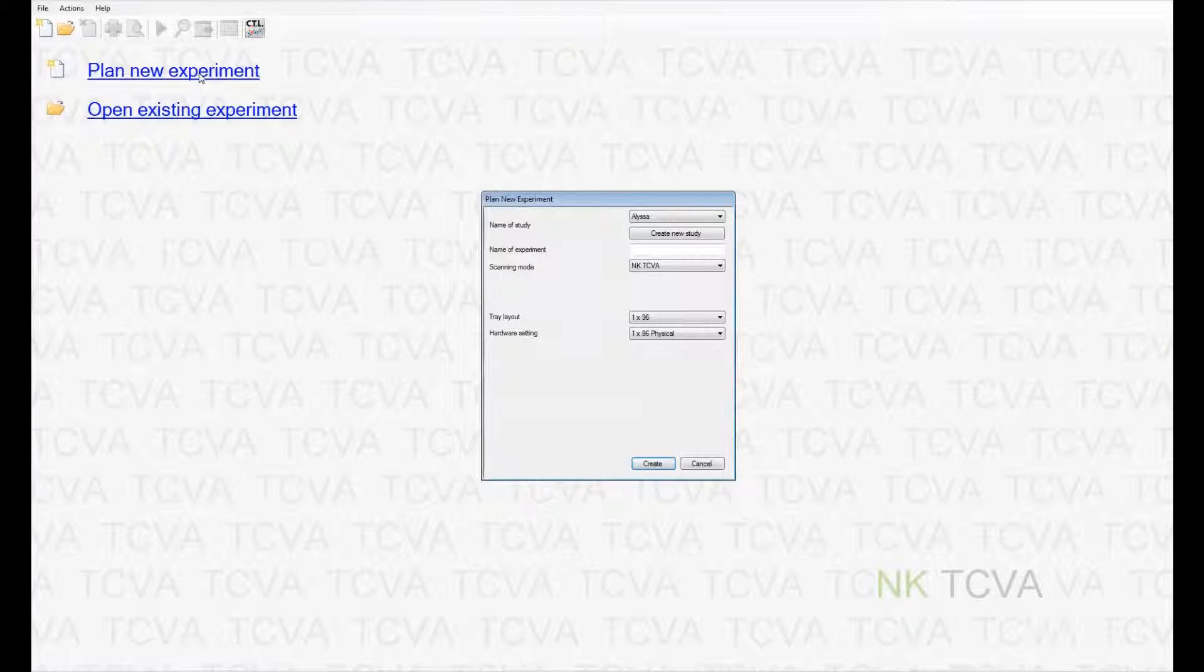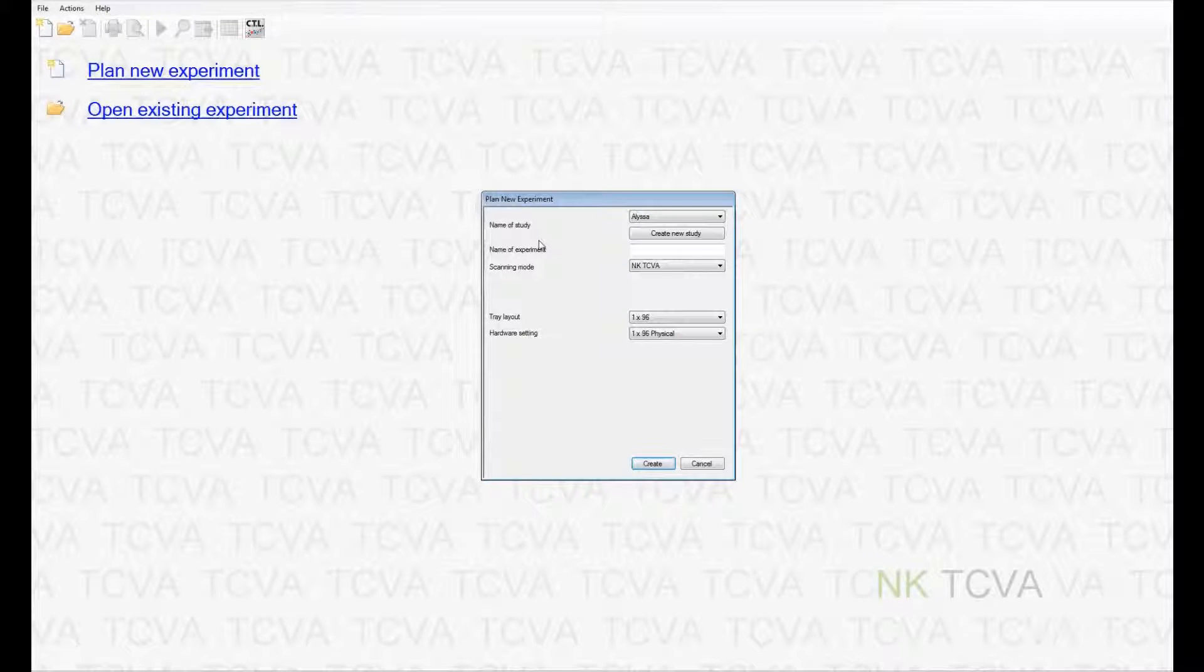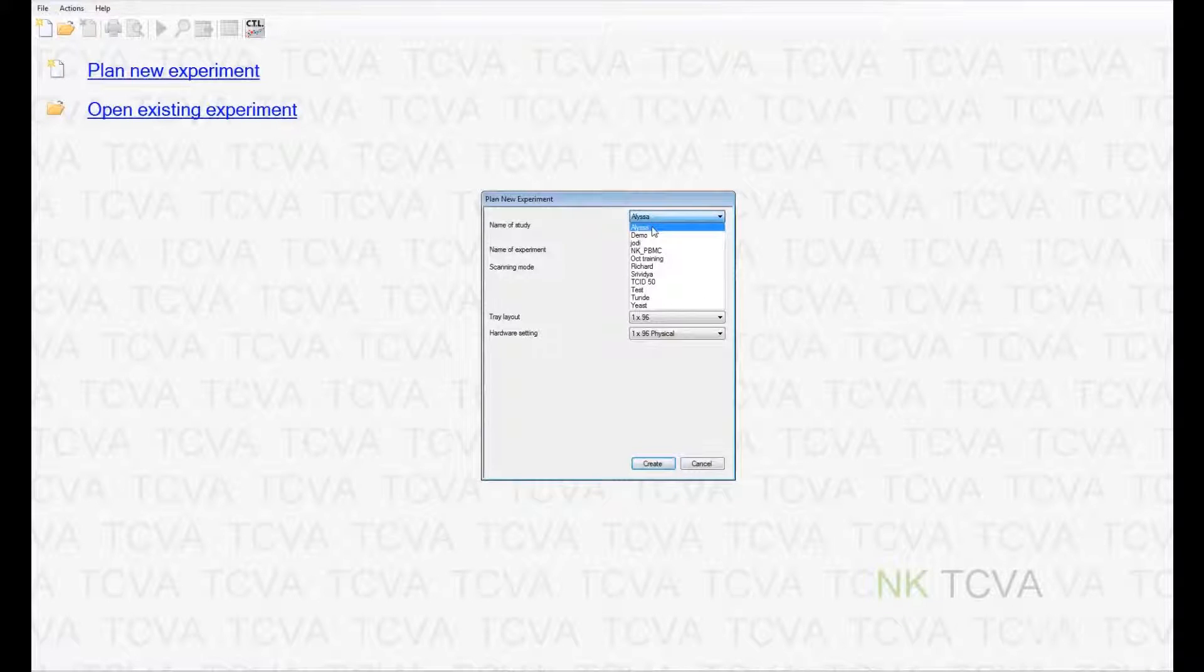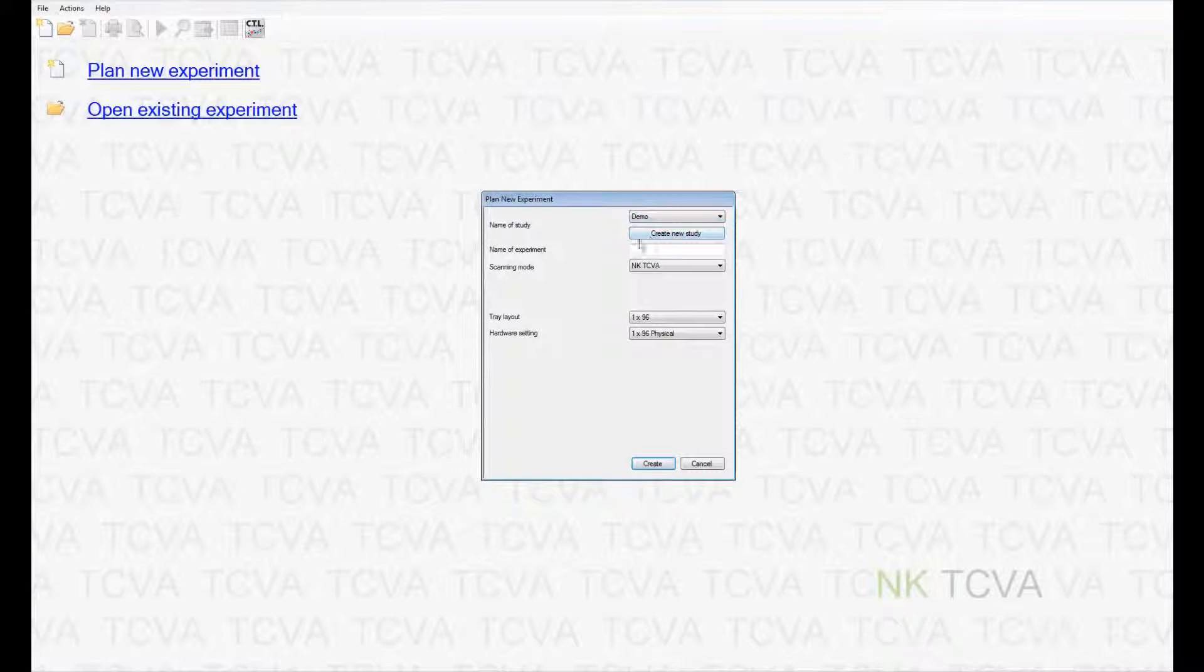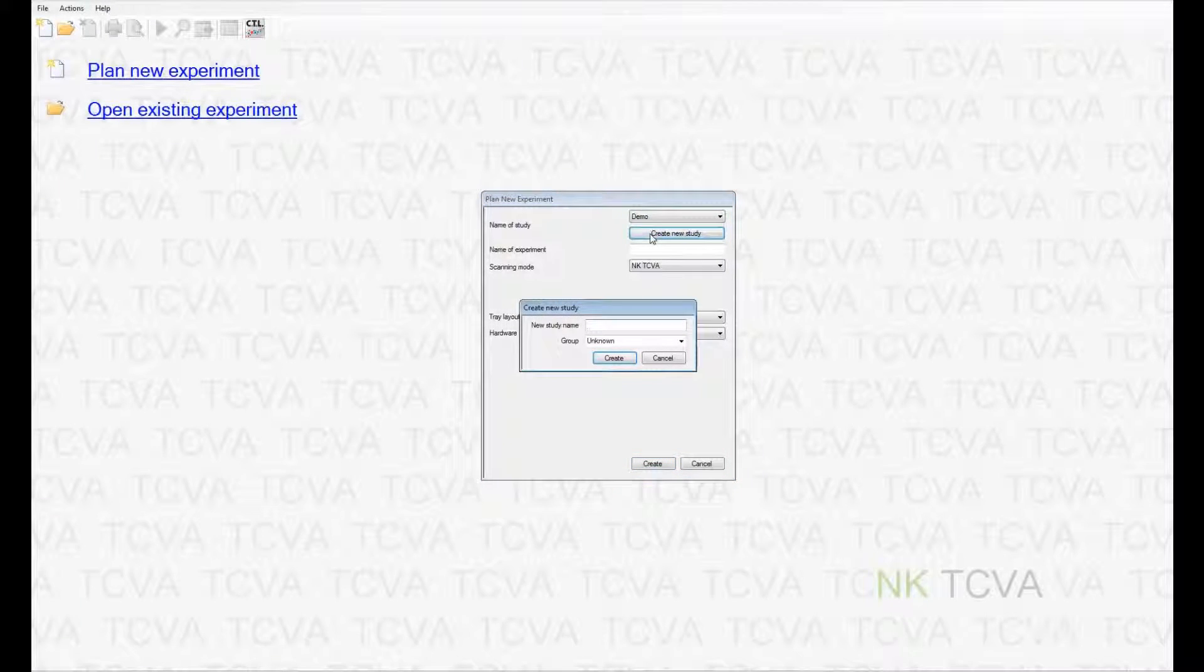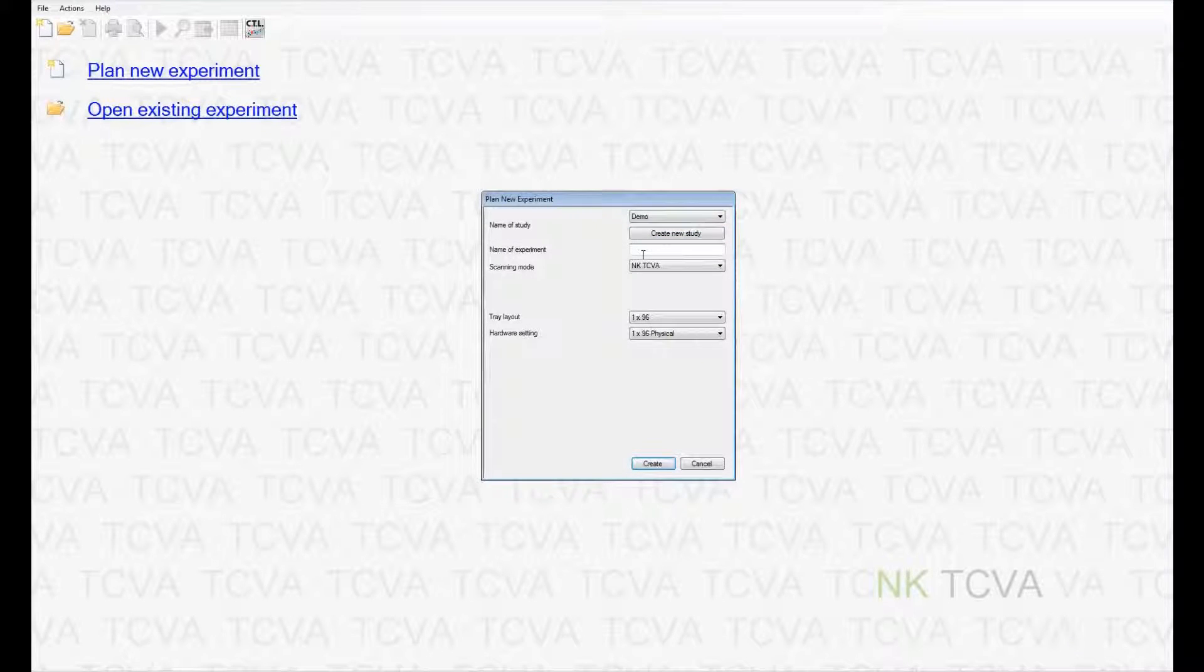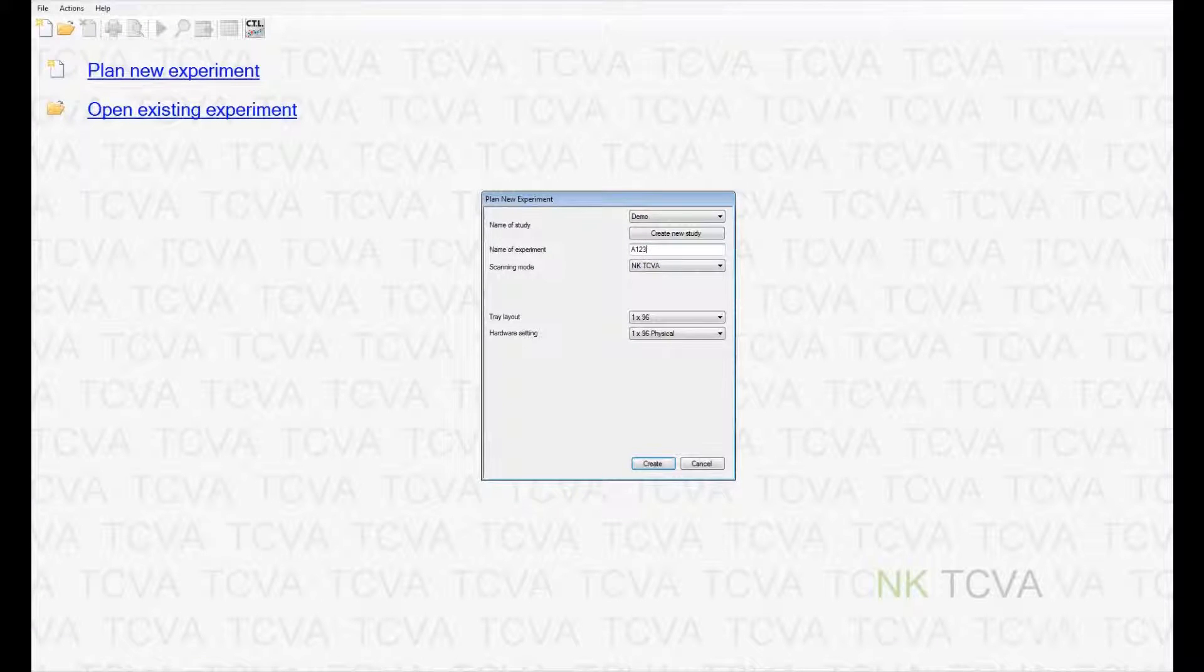Study name or name of the study is a mandatory input, but it can be common between multiple experiments. For example, I am going to use a pre-existing study name demo. You can also create a new study by clicking on the create new study link. The name of the experiment is a unique identifier and cannot be repeated within the same study.